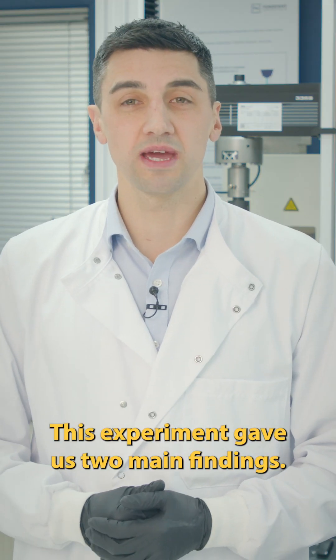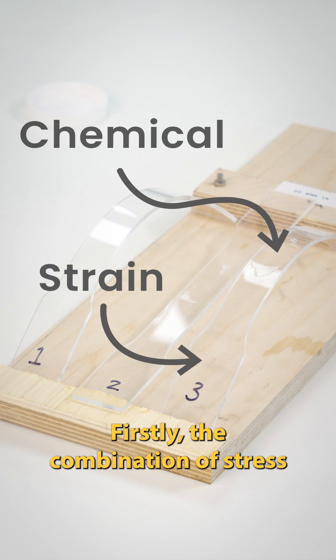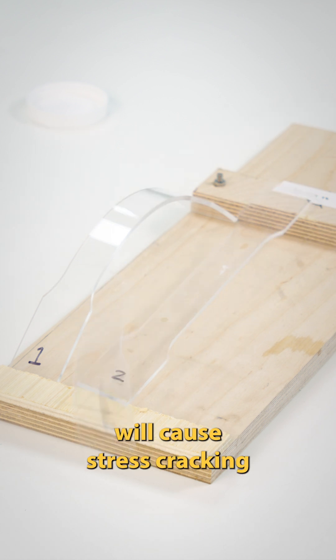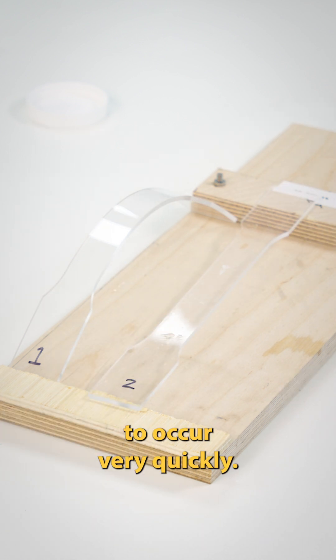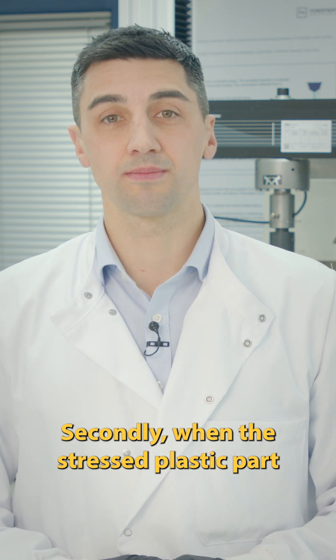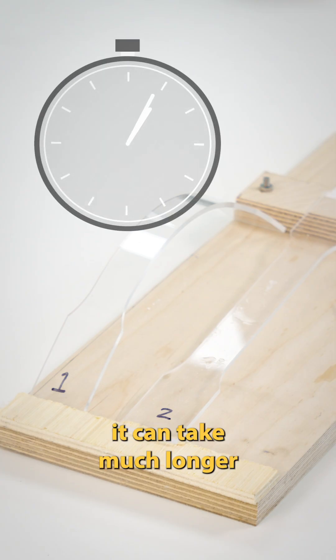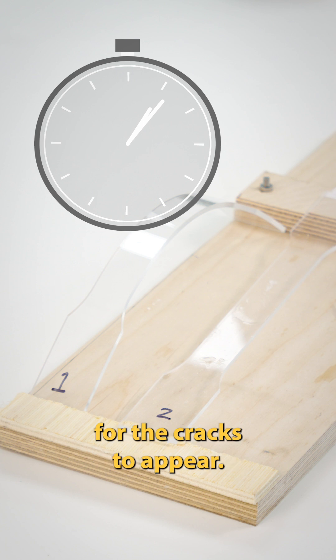This experiment gave us two main findings. Firstly, the combination of stress and aggressive chemicals will cause stress cracking to occur very quickly. Secondly, when the stressed plastic part has no chemical or environmental factor, it can take much longer for the cracks to appear.